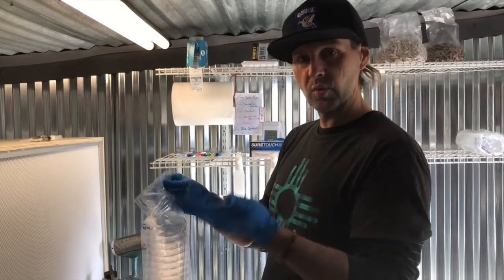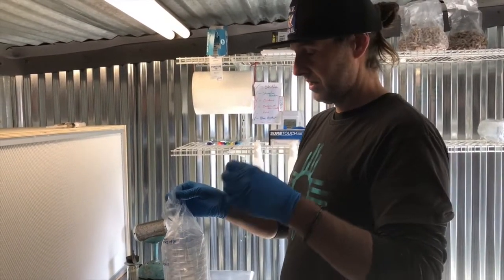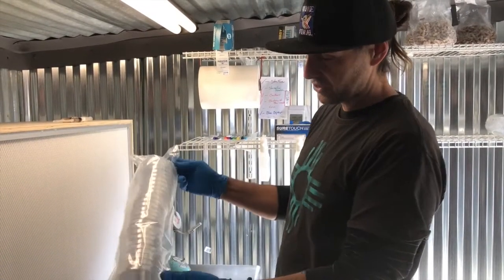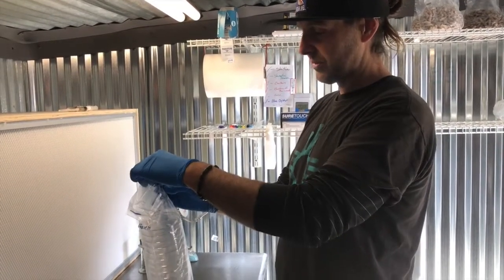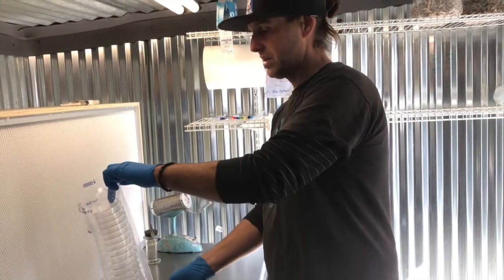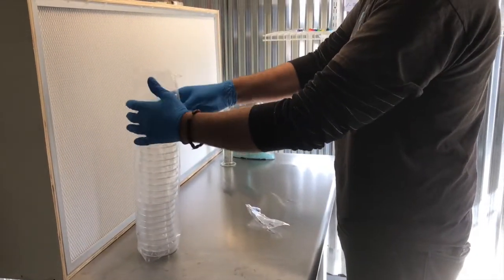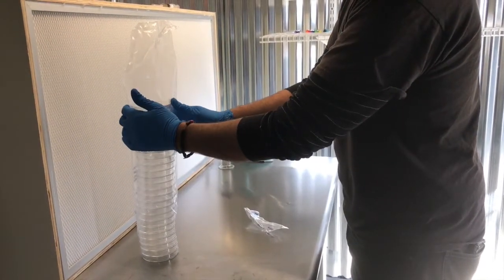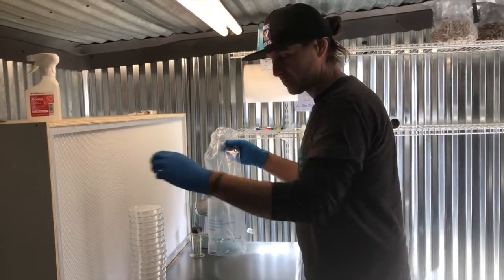We're back in the lab. We've sterilized the agar — it's been about an hour since we shut the autoclave off. Now we have a sterile sleeve of petri plates. These are perforated, which makes it a little bit easier. Make sure that if you're opening these, you do it like this in a sterile environment. We have two Erlenmeyer flasks with 500 mils of agar in each.